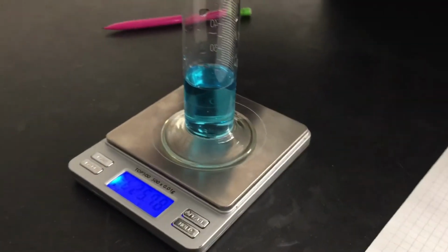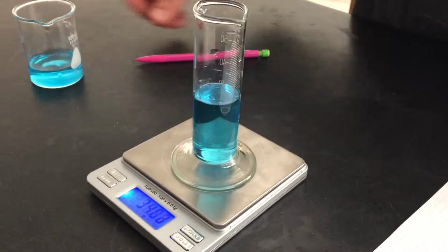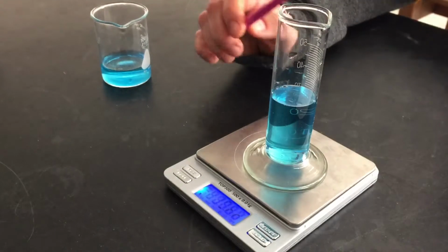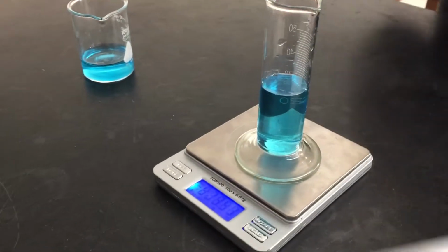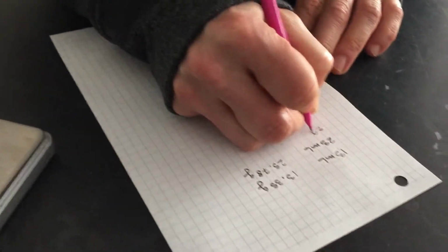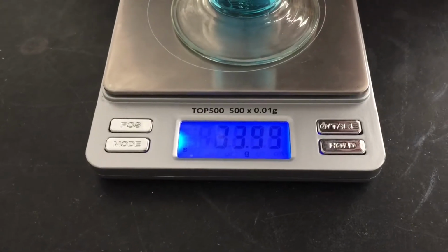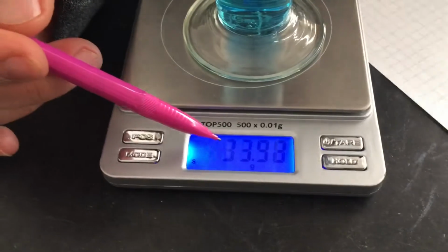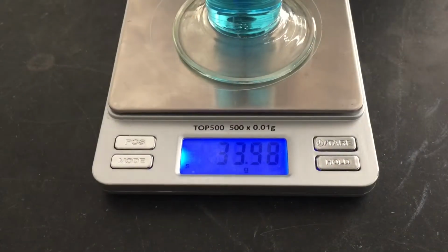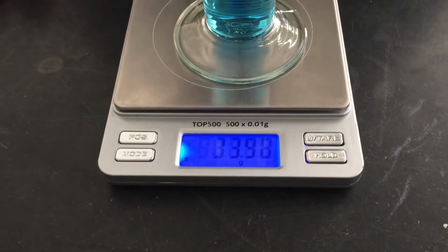And then we will repeat this a few more times until you get to your maximum measurement of, this is 29 milliliters. And you want to get to your maximum measurement, 33.99, what fun. Let's just call that 34 grams. Okay? There's no way we're going to be graphing 33.99 on our graph. So I think you get the idea.